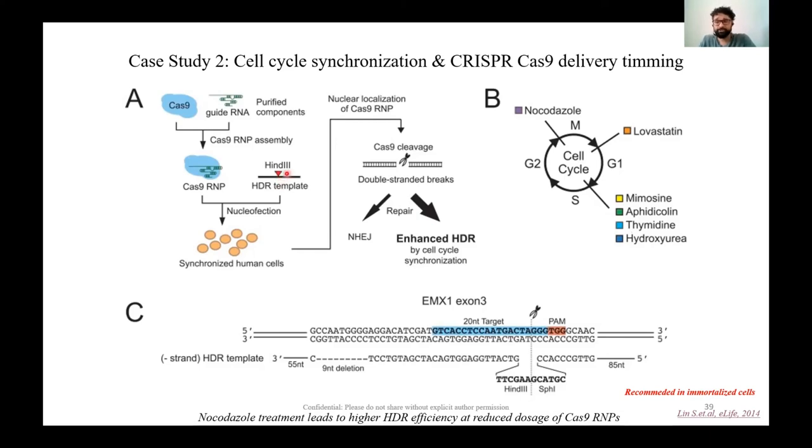You can add this restriction site for further validation, to see if your knock-in is efficient or not, but do make sure that this is outside your coding region, in the homology arms, because obviously you might end up including another amino acid that you don't want. Nevertheless, the strategy used was to synchronize the cell cycle, and the idea was to increase such efficiency.